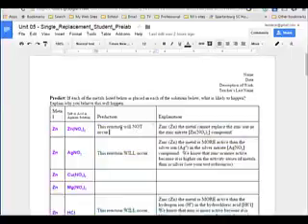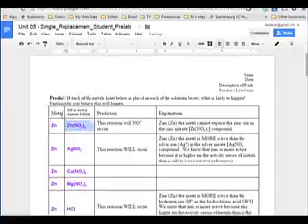Now, if you're there on your computer, you'll see what I put in here for the first row. You've got zinc already put into your chart here in the first cell and zinc nitrate in the second cell. The point of this is that it's asking you, if you put zinc metal in a solution of zinc nitrate, what will happen? You're making a prediction about what will happen.